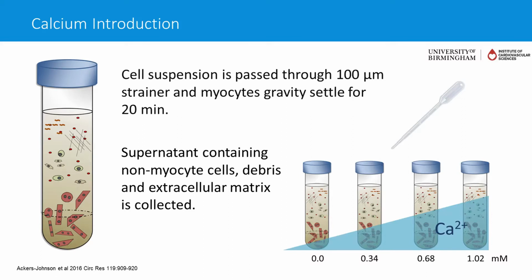I think we should emphasize that point you made: once a pellet has formed, don't wait too long before transferring it to the next tube and resuspending, because you don't want a hypoxic pellet sat around too long, right? Yep. I think these timings for gravity settling can be flexible.